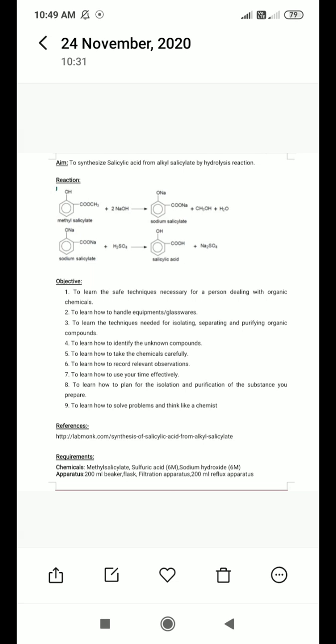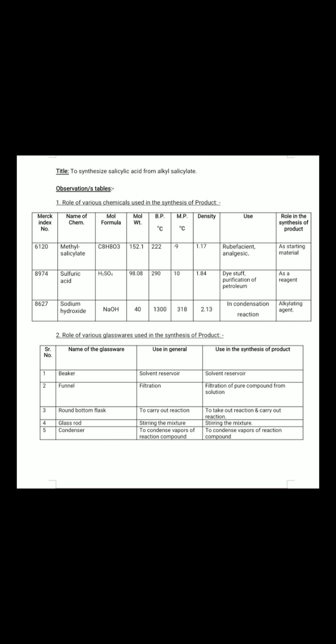For the requirements, the chemicals needed are methyl salicylate, sulfuric acid (6 molar), and sodium hydroxide (6 molar). The apparatus required includes a 200 ml beaker, flask, filtration apparatus, and a 200 ml reflux apparatus. These requirements are needed at the time of synthesis.